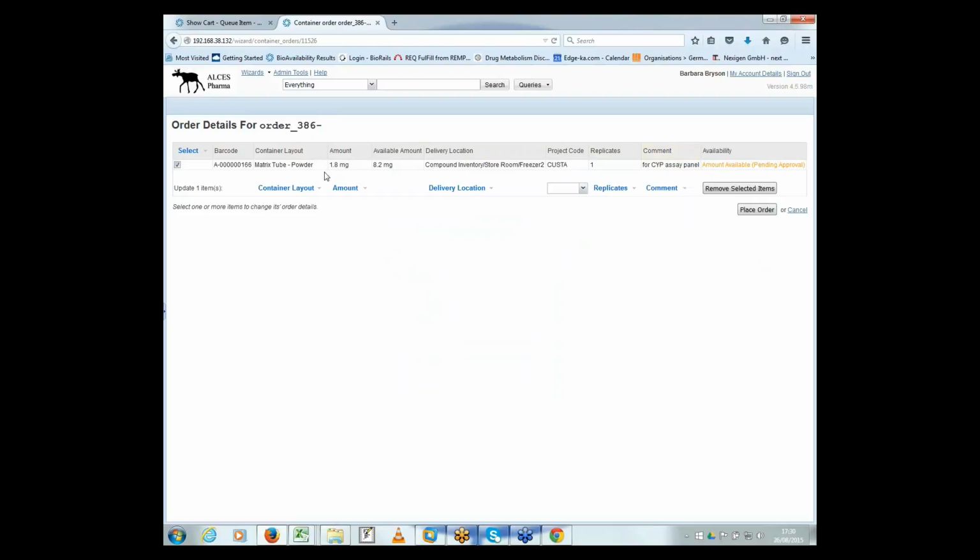And you notice here, as I filled in the amounts, the availability was evaluated. So it's saying there's an amount available, however, it's pending approval because this particular sample has a protection on it. So let's go through and place that order.